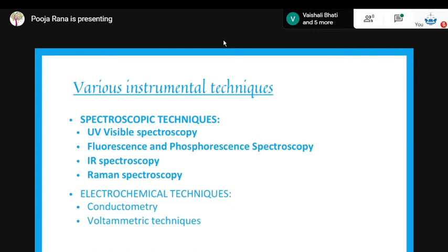All right, so this spectroscopy uses light in the visible and near UV and infrared ranges also, and the absorption in the visible range directly affects the observed colors of the compounds which are involved. And atoms and molecules undergo electronic transitions when they are exposed to radiation of this particular spectrum.